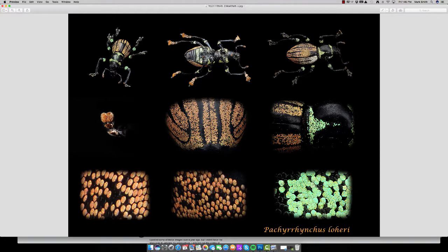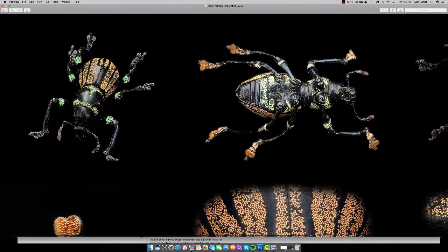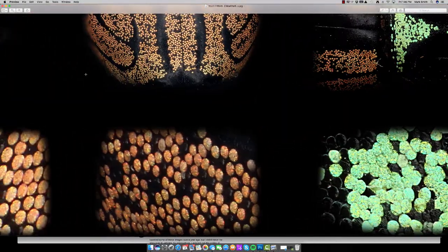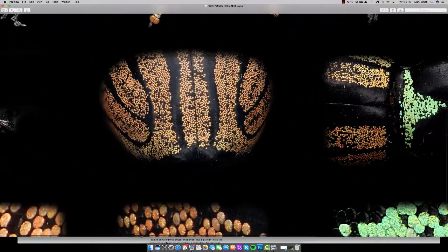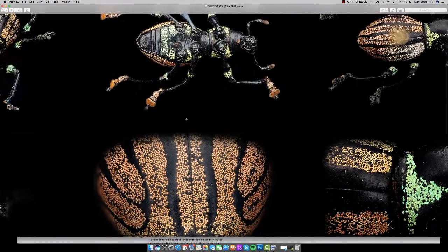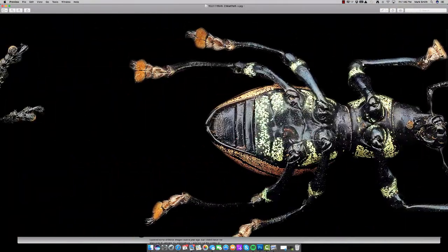These are some contextual images of the same specimen, which was a weevil, at 1:1 magnification, so just 1x. And then these are some close-ups down here at 5x, and then some image crops of those 5x images. So we stepped it up a notch using the micro kit. Here we were imaging the same scales that you see here on the abdomen of this weevil, but we were using 10, 20, and 50x objectives to do that.